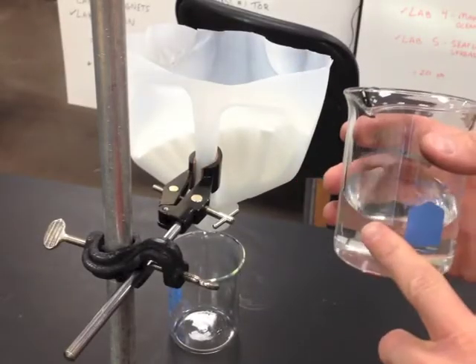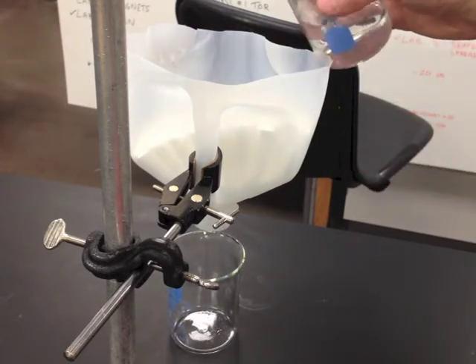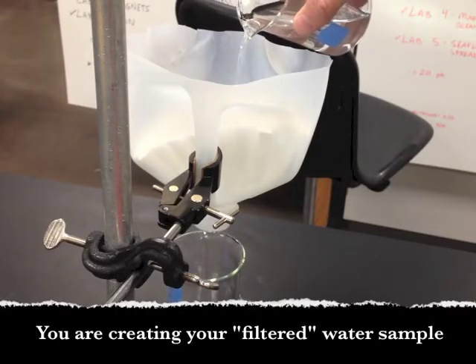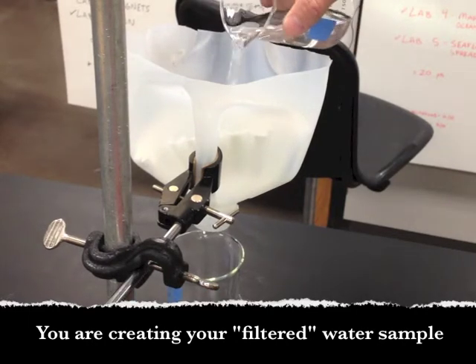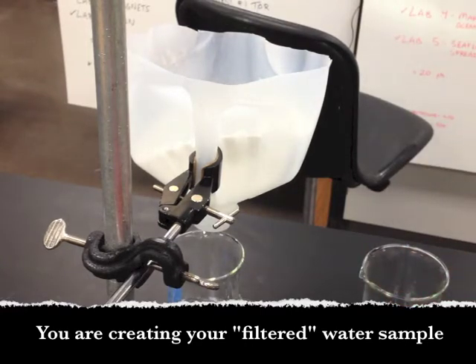Now take your settled water sample that you've already done your readings on and pour it through ten coffee filter papers that are already nested and ready to go. Carefully pour that through and collect the sample in a very clean 250 mL beaker — that will be your filtered water sample. This sample has already been settled and now filtered. Run the three tests again — conductivity, pH, and turbidity — on this filtered water sample.